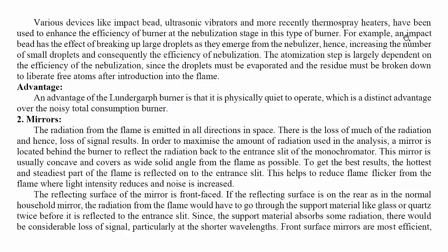For example, an impact bead has the effect of breaking up large droplets as they emerge from the nebulizer, hence increasing the number of small droplets and consequently the efficiency of nebulization. The atomization step is largely dependent on the efficiency of the nebulization, since the droplets must be evaporated and the residue must be broken down to liberate free atoms after introduction into the flame. Advantage. An advantage of the Lundegardh burner is that it is physically quiet to operate, which is a distinct advantage over the noisy total consumption burner.